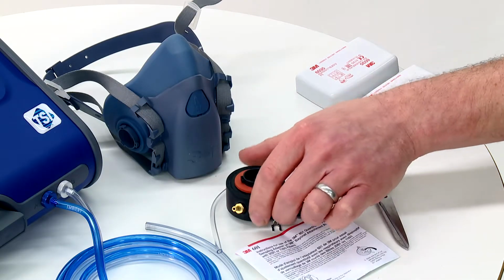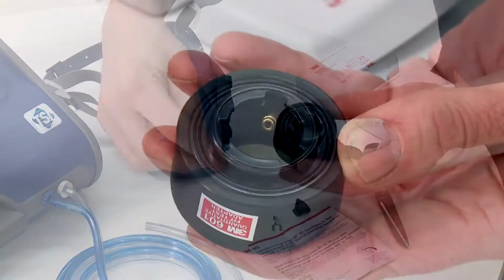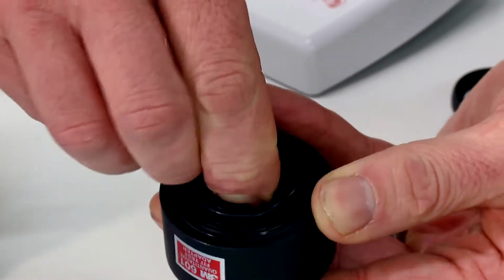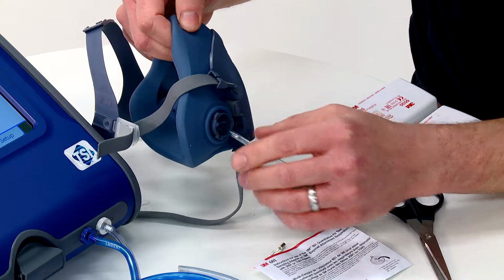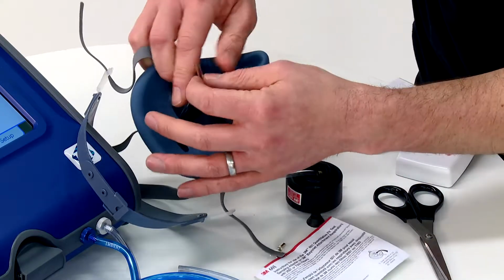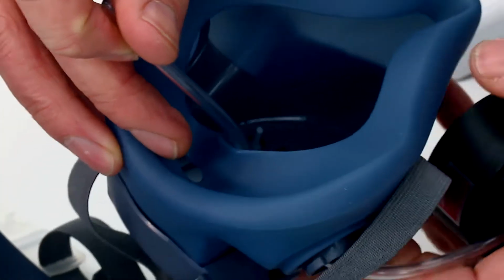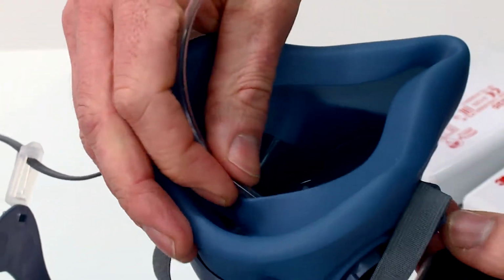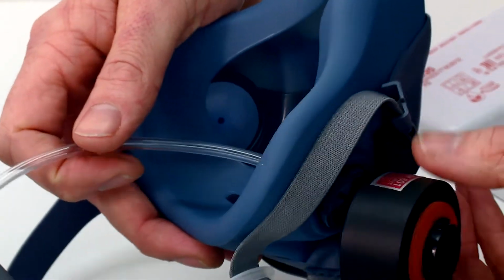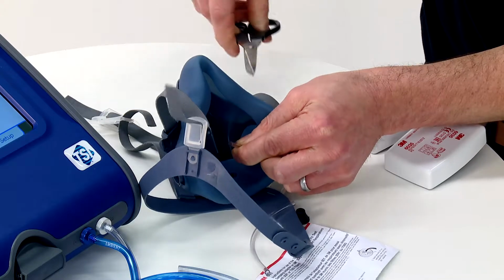For reusable respirators, the 3M 601 fit test adapter should be used. Connect a length of the supplied tubing to the internal connection of the 601. For a half mask, feed the other end of the tubing through the inhalation valve of the respirator directly into the facepiece. Note, the 601 adapter should be connected to the right-hand side filter bayonet of a 3M mask so that the tube connection to the PortaCount is pointing down. Cut the tubing to length so that the end terminates within the breathing zone.